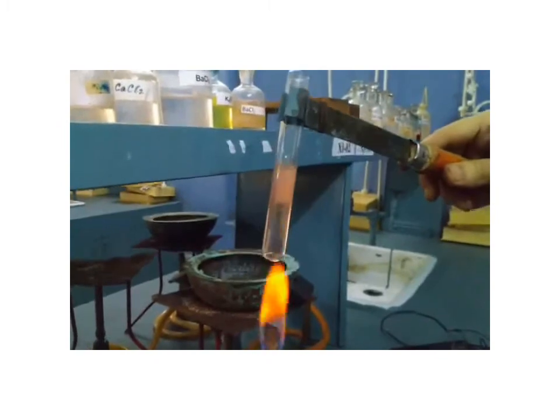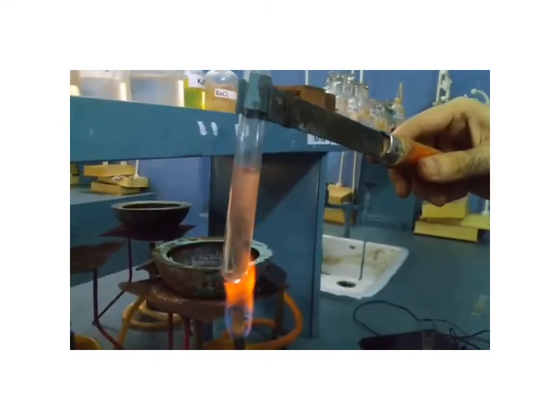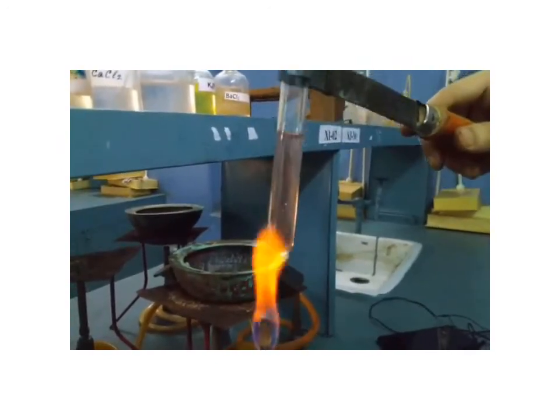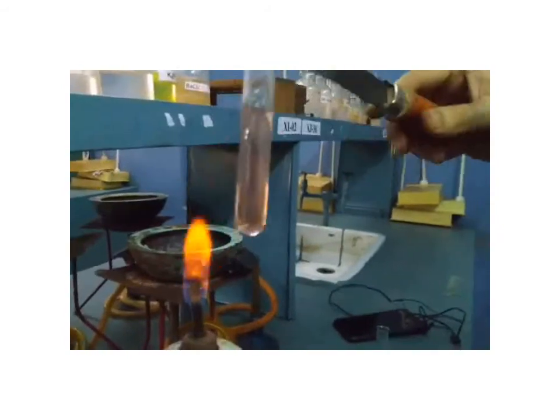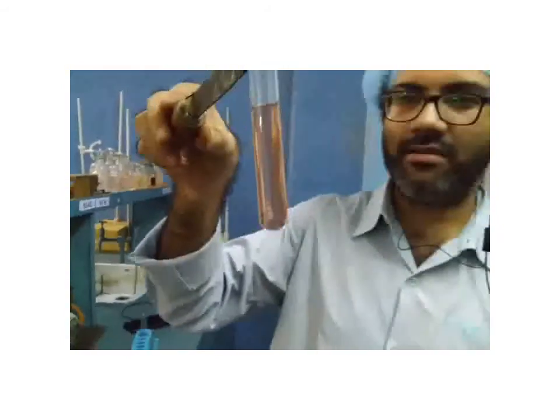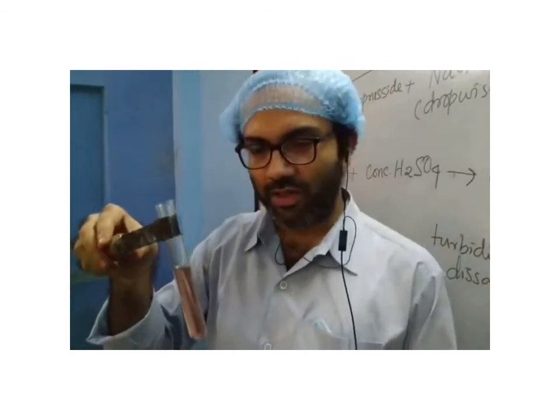As you can see, the turbidity is disappearing. Can you follow? The turbidity is disappearing, and you can see a transparent solution. Just check it out. Before there was turbidity, and now it's a transparent solution. Nothing is there. It's a clear, transparent solution. So this is a confirmatory test for glycerol.